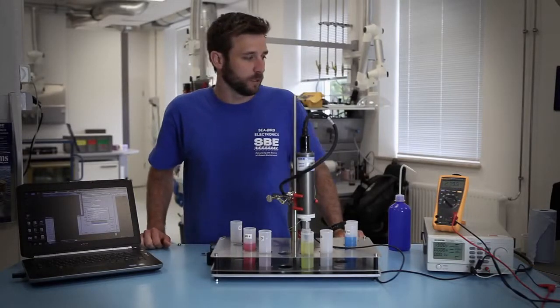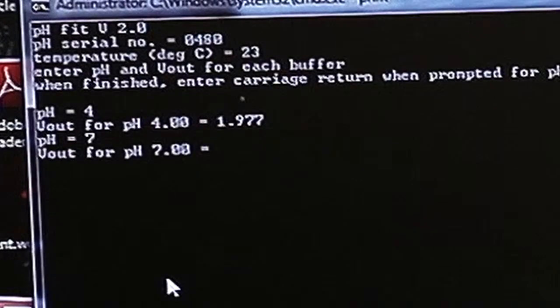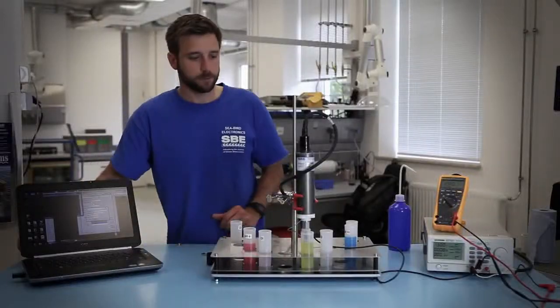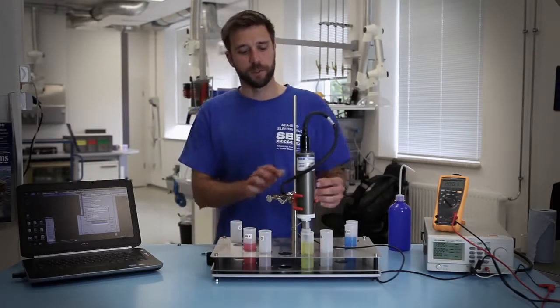And move it to the final buffer solution pH of 10.